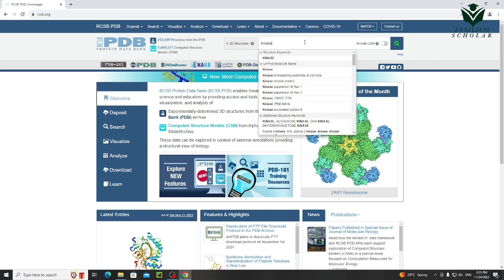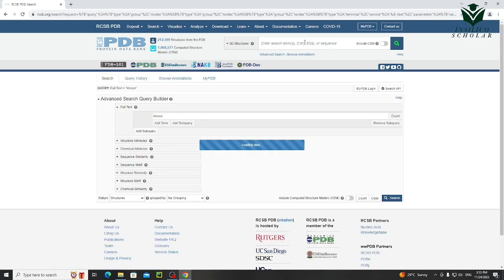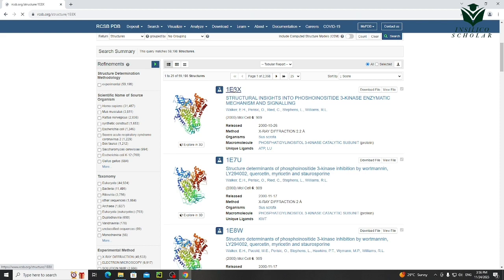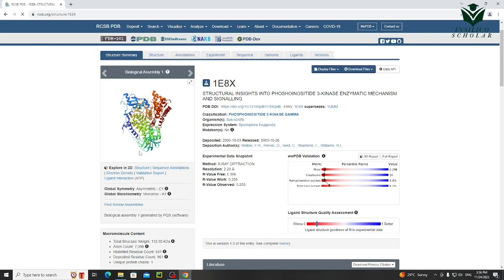Today we are diving into the protein databank, a treasure trove of molecular structure that holds the secrets of life itself. In this video, we will explore how to navigate the protein databank to find specific proteins using the example of kinase protein. Let's dive in.